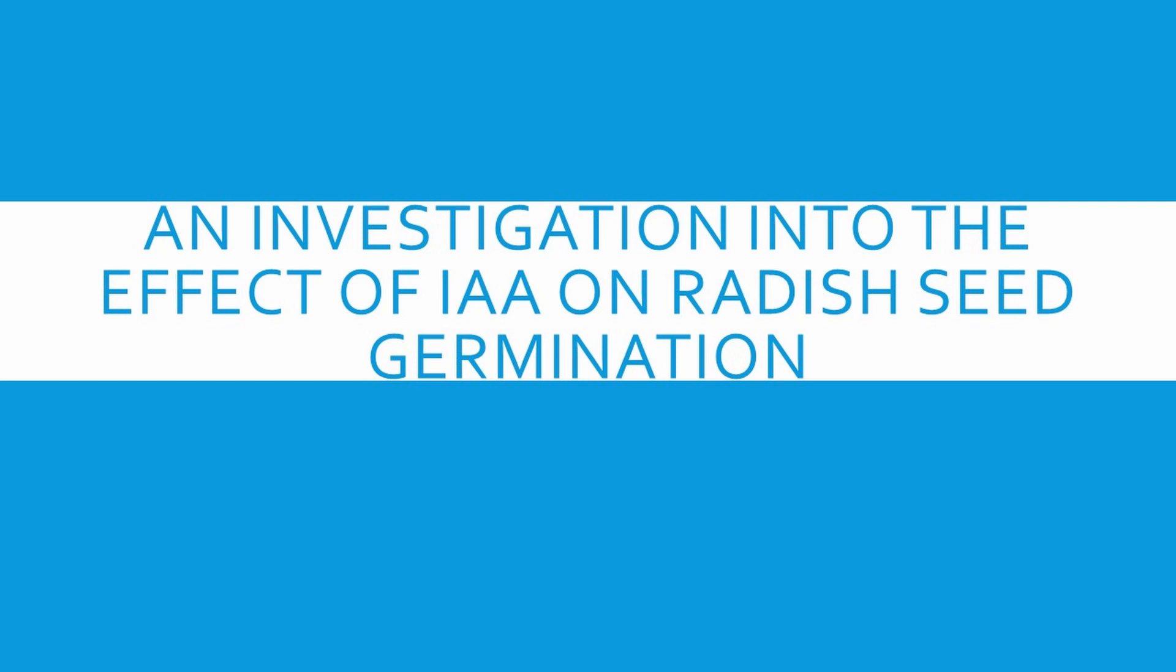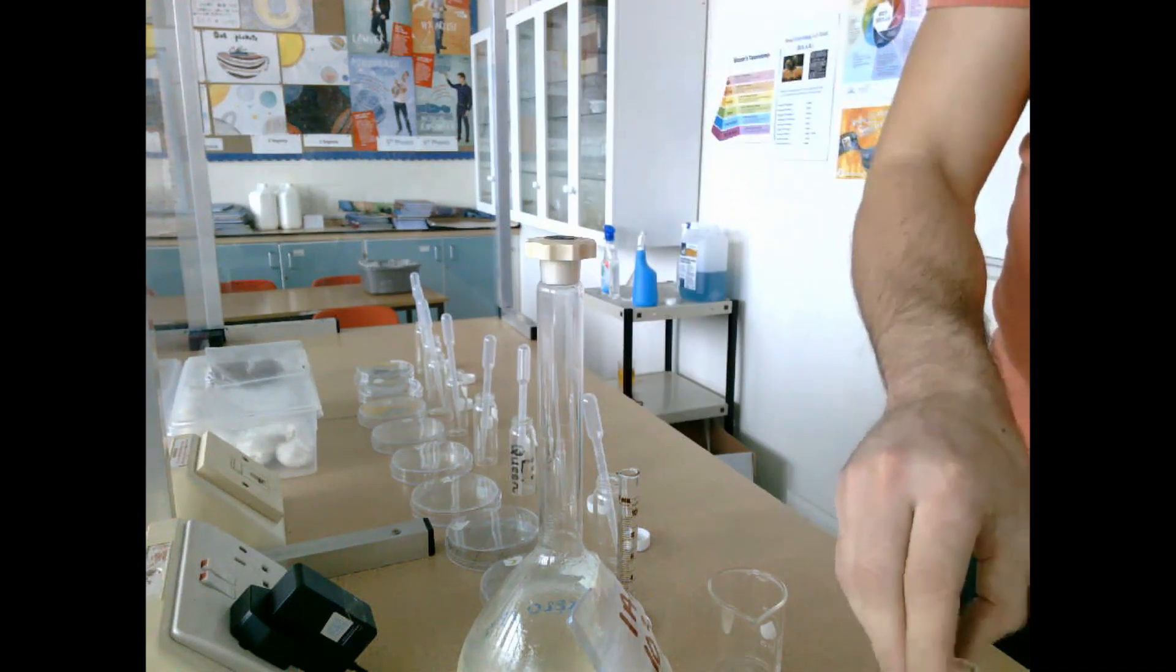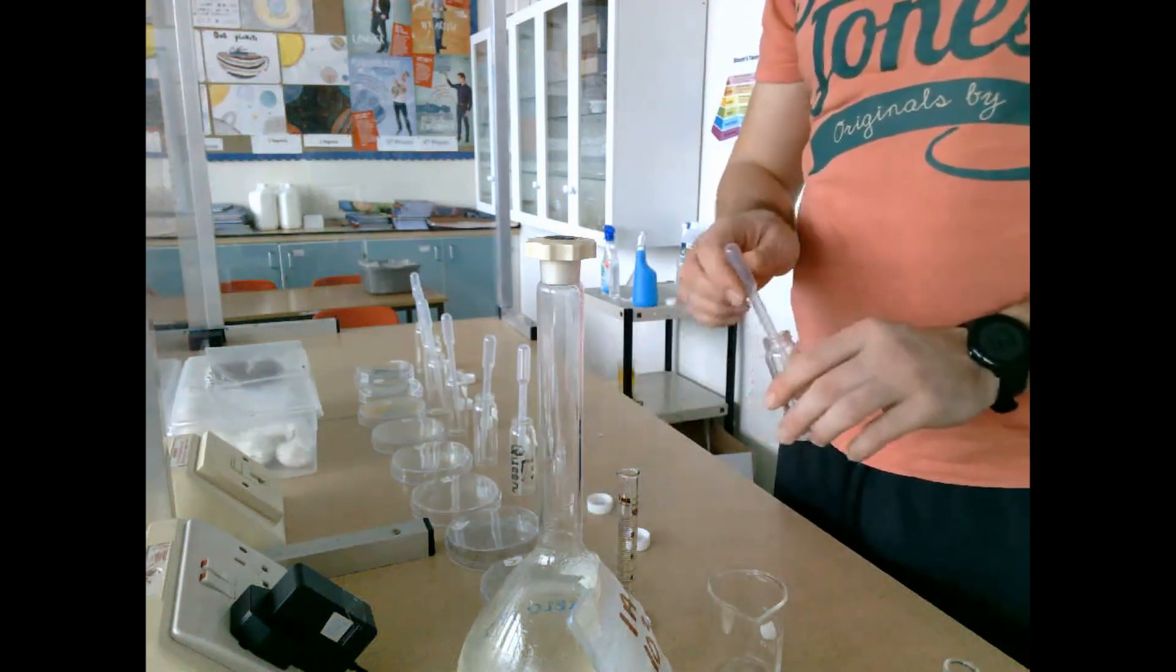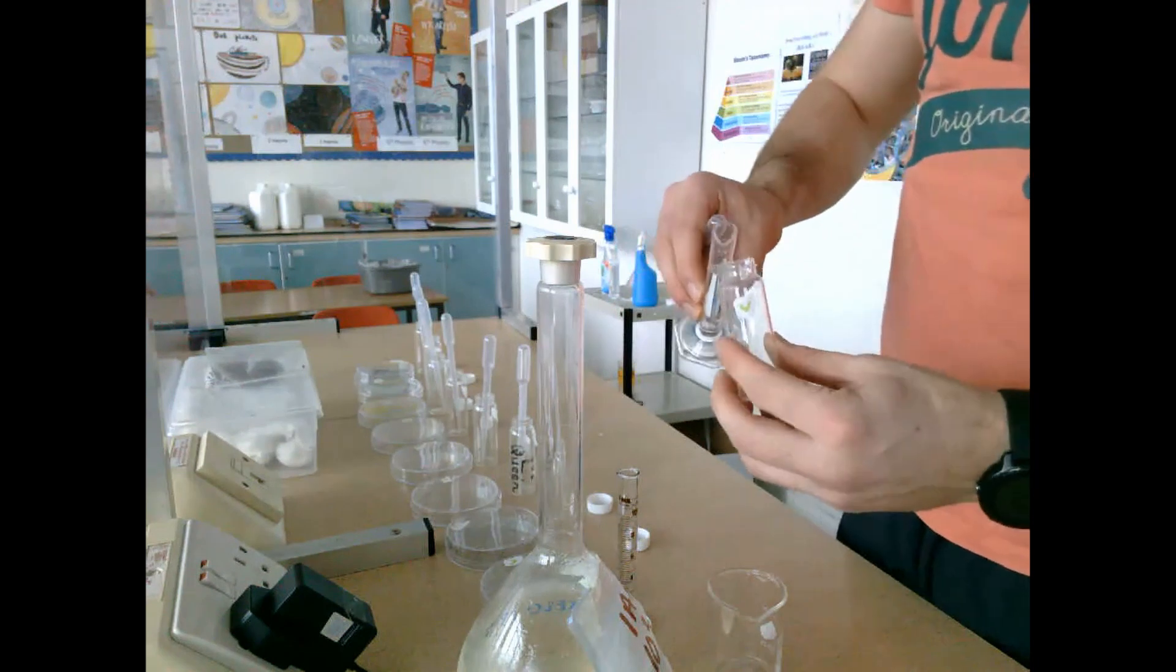We take a graduated cylinder and measure out nine milliliters of water. This nine milliliters of water is then going to be added into glass jar number one.